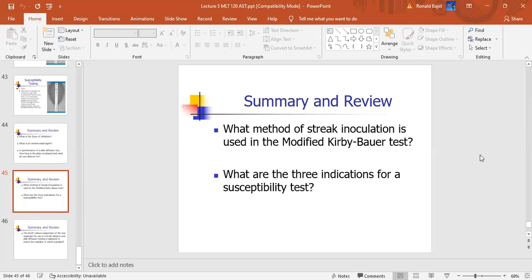So the gram stain from a colony is not really the true morphology of the organism. If you want to know the true morphology of your organism, you need to do your gram stain from liquid media. That will give you the true morphology of the organism. So for staph, Micrococcaceae, there's no such thing as pairs and chains.